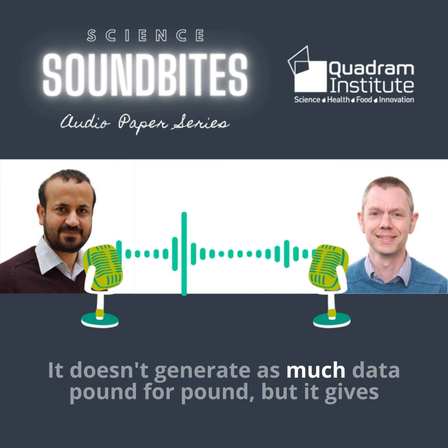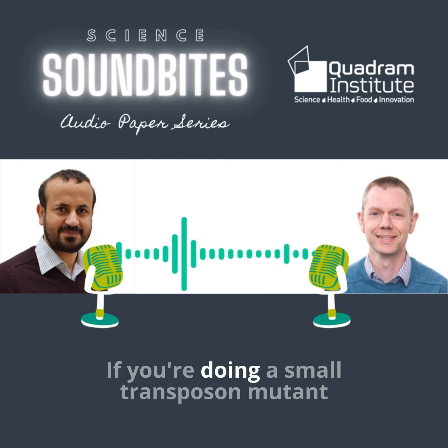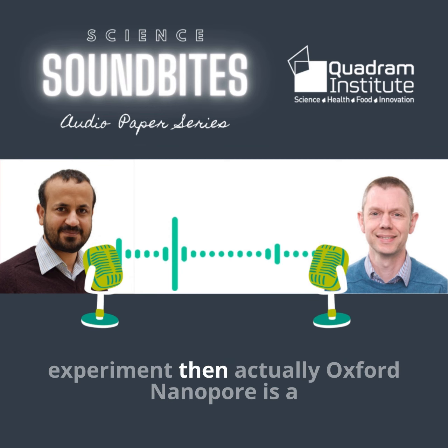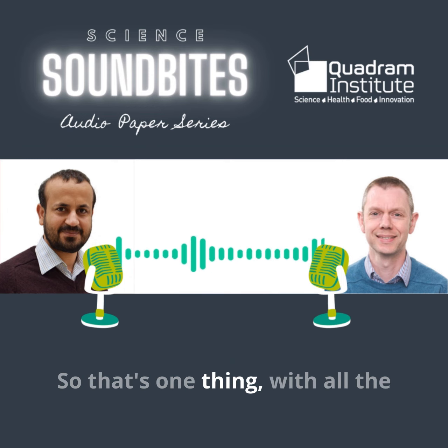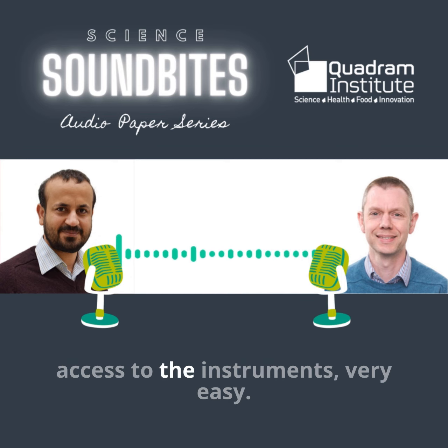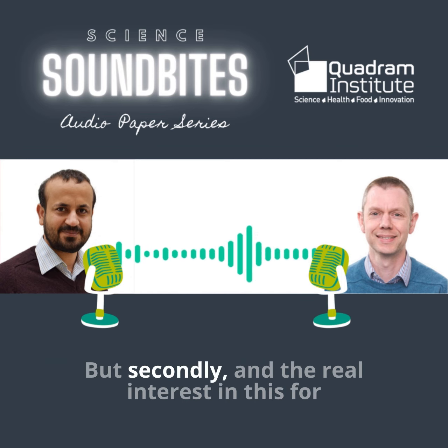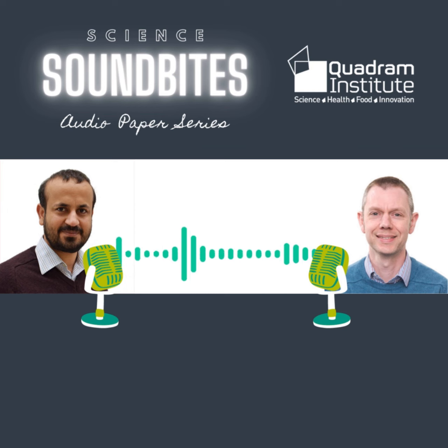It doesn't generate as much data pound for pound, but it gives you enough. So you have scalability in your experiments. If you're doing a small transposon mutant experiment, then actually Oxford Nanopore is a potentially viable solution for sequencing it. So that's one thing, with all the flexibility that that entails in terms of access to the instrument, which is very easy.